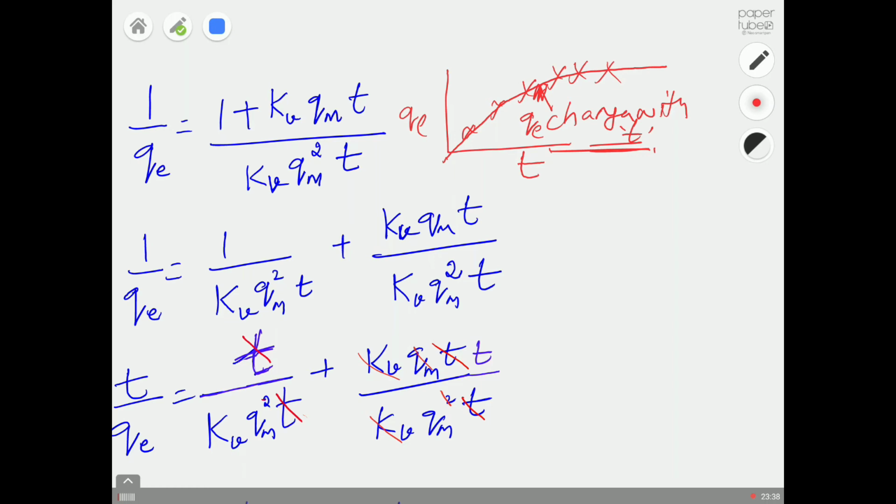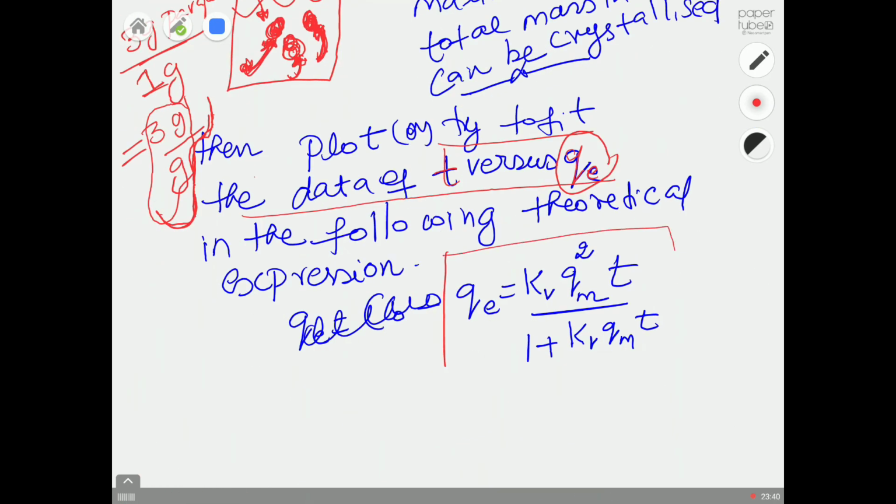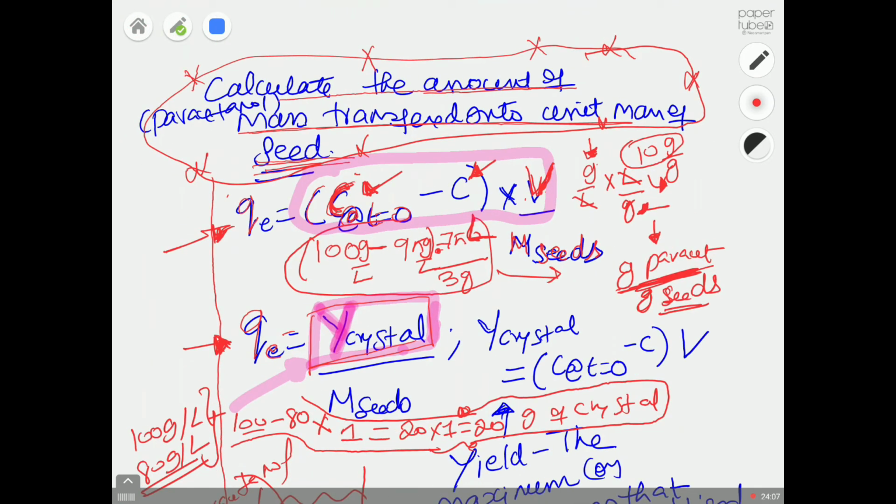So for this exercise, you are going to use this one equation. This might sound very tricky. So what I will do is explain now in this video, and then I will try to show you in Excel how to do these calculations for maybe a few data points, and then you can do the rest of the calculations by yourself. So once you calculate QE using this equation, let me write that equation.